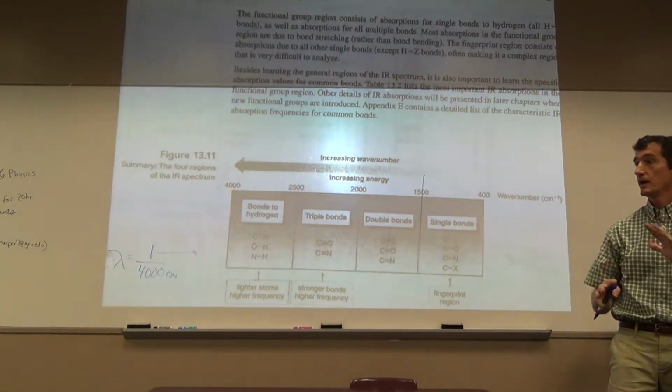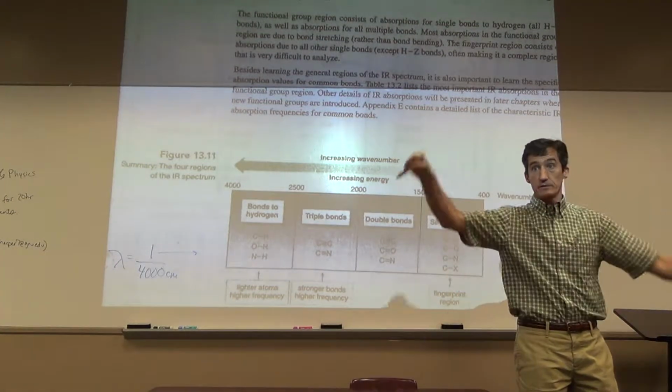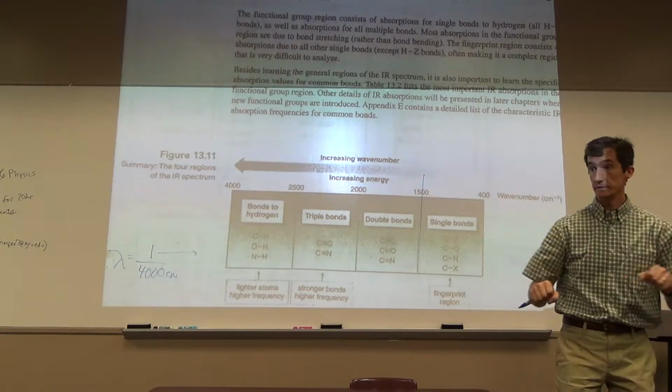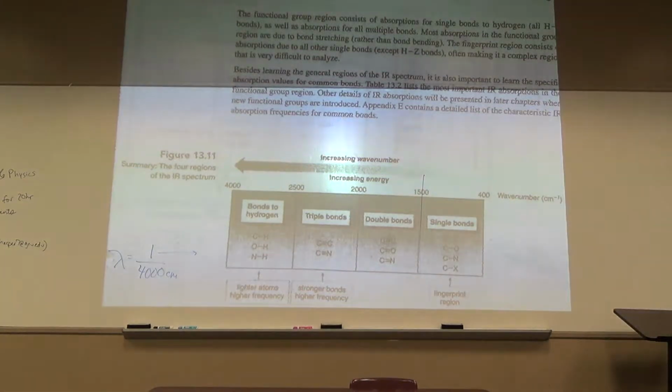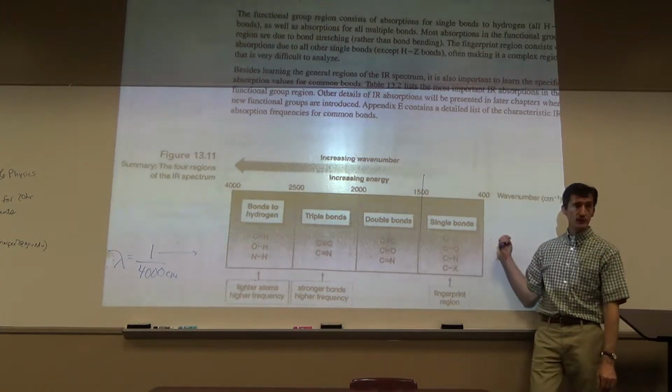All the bonds, and it can be more than just 2 atoms. It can be 3 atoms that move sort of like this. All this stuff can have frequencies, and all these frequencies can match IR frequency and give absorptions. Okay, in the end, single bonds are going to give peaks in the fingerprint.